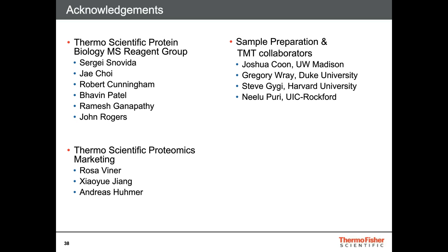So for most LCMS analyses, even using a 50-centimeter column, you pretty much only need to load 1 or 2 micrograms on. And if you have your replicates within your TMT, you may only have to shoot the TMT sample once or twice to get your technical replicates on the instrument. So you're basically labeling a lot of sample. Unless you're doing phosphopeptide enrichment, in that case, 1 milligram is perfect.